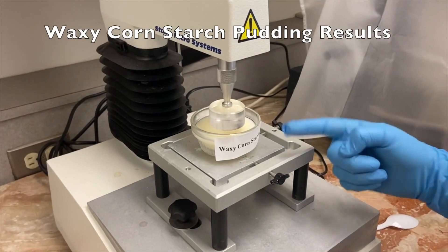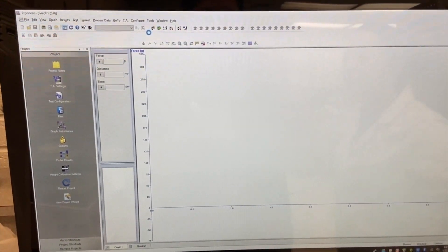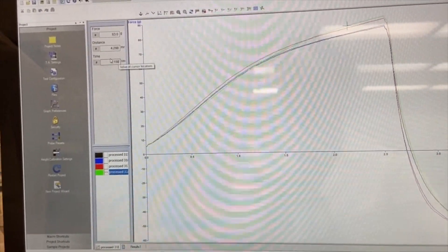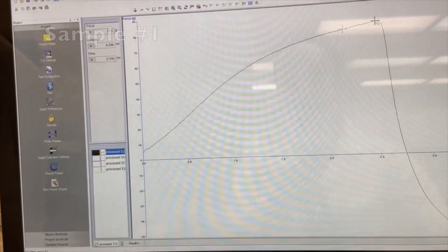Waxy cornstarch pudding — sample one. Run the test. These are the waxy cornstarch pudding results for sample one. Choose the highest peak and record the force.